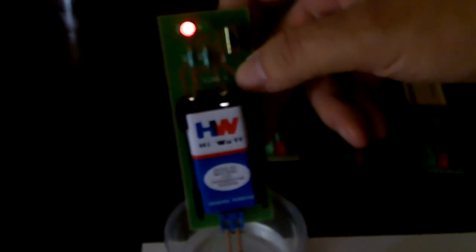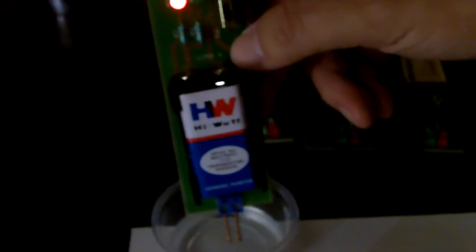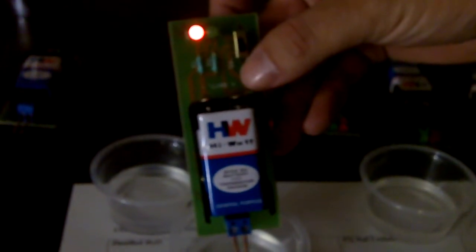So the first thing we're going to test here is going to be the distilled water. On your data table, you're going to indicate whether or not the light that comes on is strong, weak, or none. So this first test is for distilled water. Second test here, this is for the 10% glycerol. Third test, we have just a piece of regular old household aluminum foil.